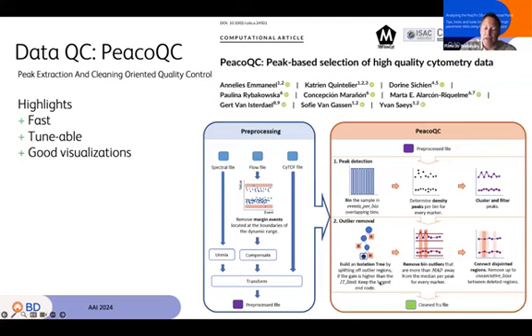So anyway, you unmix, you transform the data first. So you'll put it on your proper scale, having either unmixed or compensated it. Then you'll run the bulk of this algorithm. This is different from most of the cleanup algorithms that we generally recommend people run on the uncompensated data. What you're really looking for is variability with time. So theoretically, whether it's unmixed, raw, compensated, uncompensated, et cetera, it shouldn't matter. But for traditional data, why not run it on the raw data, the uncompensated data? Because then there's no way to confound a compensation error with an actual artifact from acquisition.